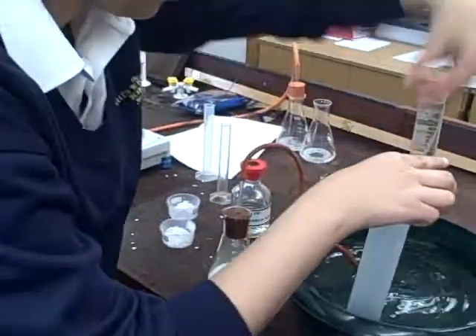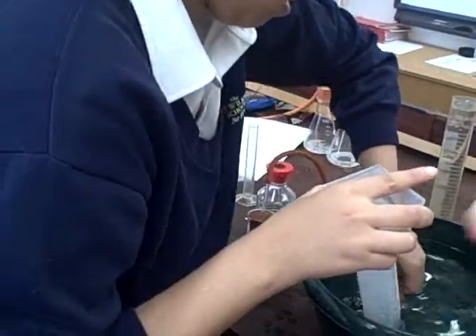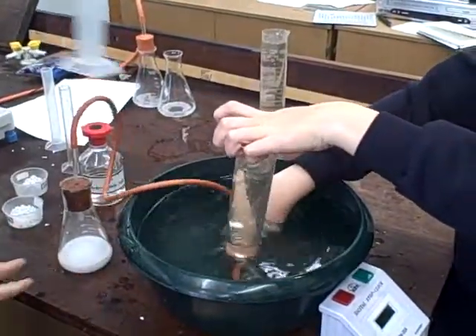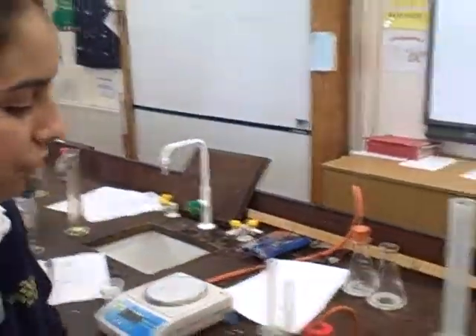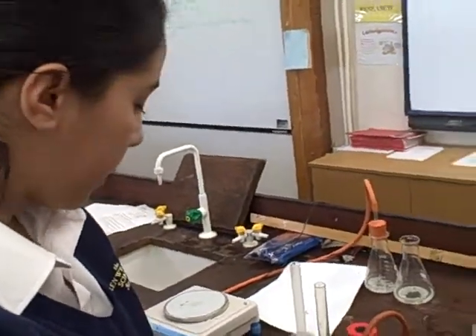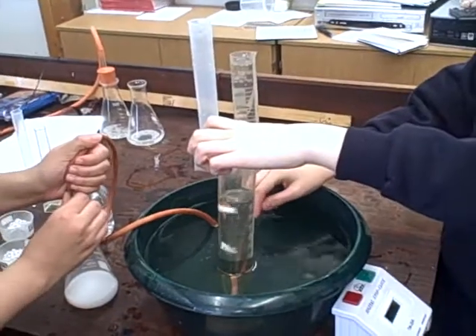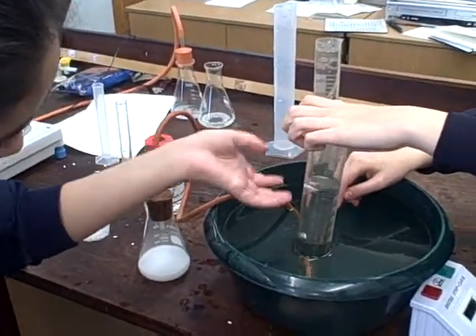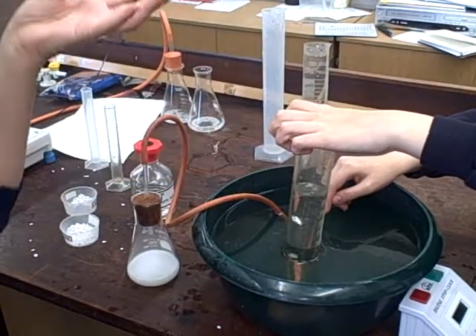We're changing it now because we just need to keep the reaction going. As you may have noticed, I've tied up my hair for safety reasons, and we're standing up because it helps to observe the flask. You can see the volume is still being lost, so we're losing mass as more carbon dioxide is being made — our reaction is quite fast.